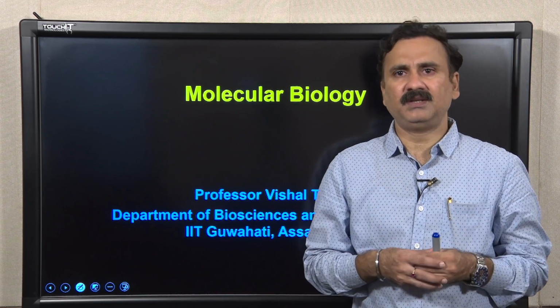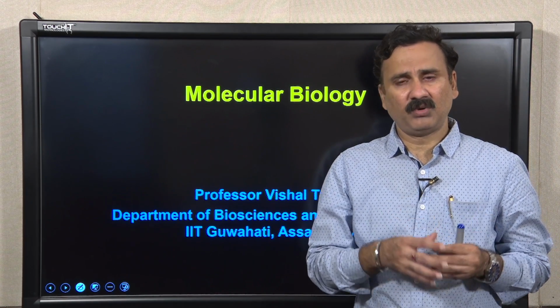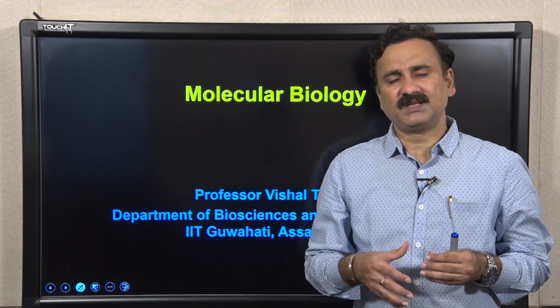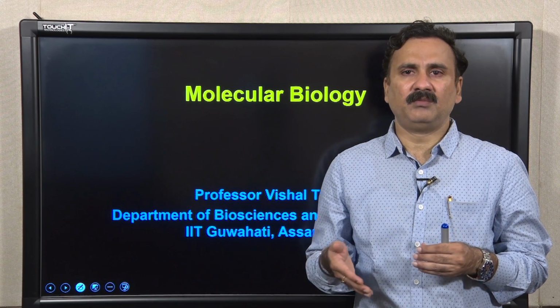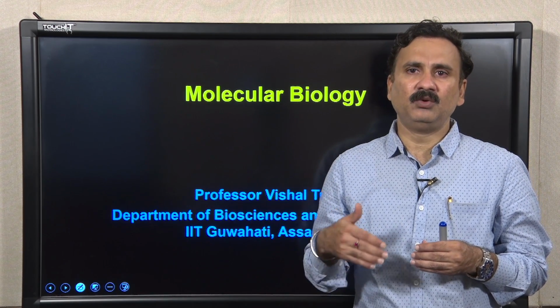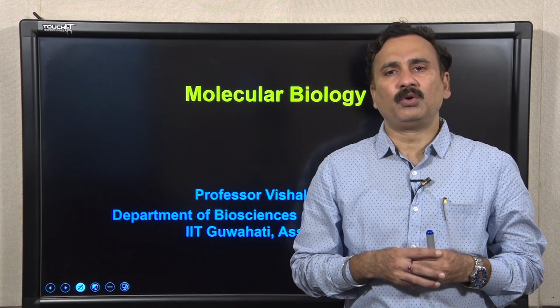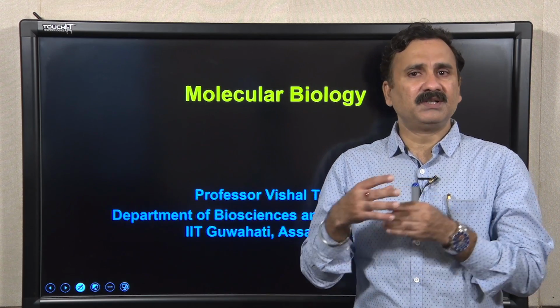In this series, in our previous lecture, we discussed northern blotting. Northern blotting is a technique used to detect the RNA present in the cell. We discussed that you first isolate the messenger RNAs from the cell, and then blot that onto the nitrocellulose membrane, and then incubate it with the radioactive probe. Eventually you do the washing, and ultimately you take the autoradiogram, which gives you the signal wherever the gene of your interest is present.